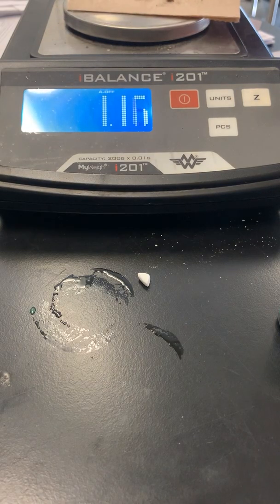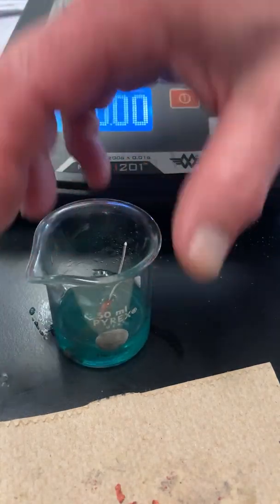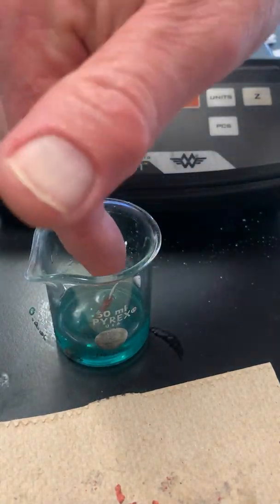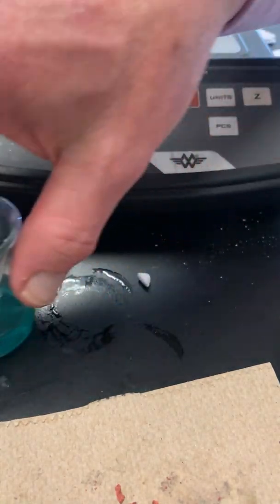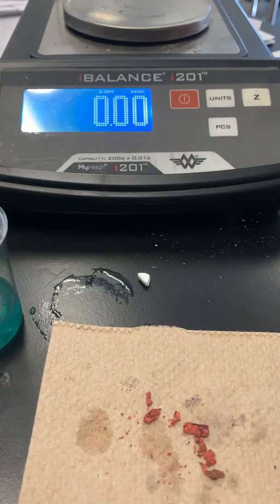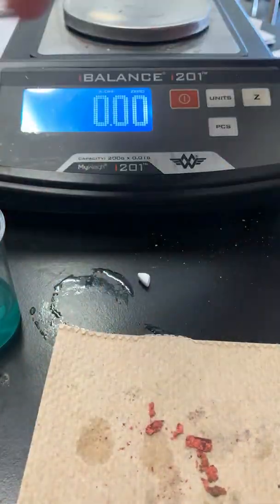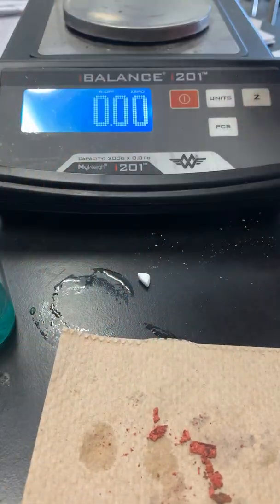And that copper is the copper that's leaving the solution and going onto the wire. And then I let it dry, so there's hardly any water on my paper towel. And so now I know the mass of the copper. It was 1.16.